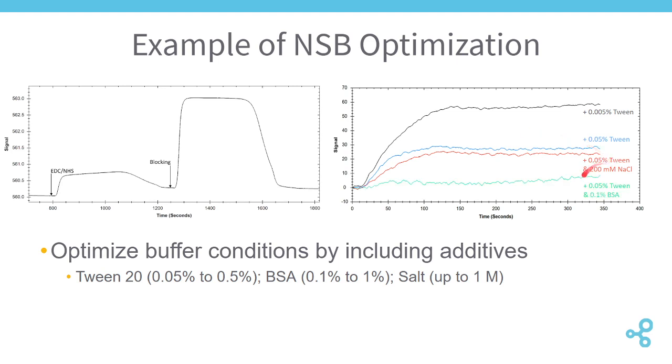In this case, we've now added 0.1% BSA, and we see that all of that nonspecific binding has been optimized. So again, these control experiments are very important, because as we can see, those first 3 injections look like semi-decent binding curves. However, they're false positives since we have 0 ligand on the surface. So this binding is not true binding to our ligand.